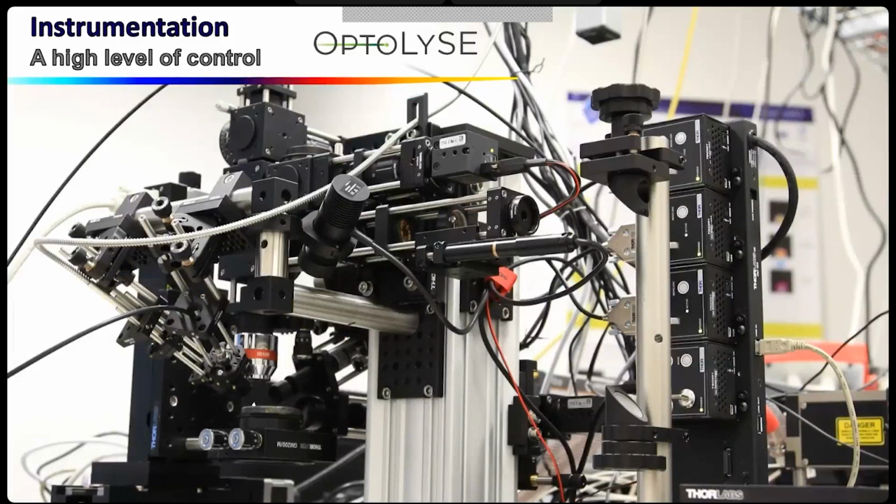Okay, so this is the instrument. If you know a little bit about playing with optics, you will recognize Thorlabs cages, rails, and so on. It looks very big, but in fact, it's just 1 square meter. It's a kind of custom microscope. The laser beam arrives here, focusing down. Here we have a reflective objective.